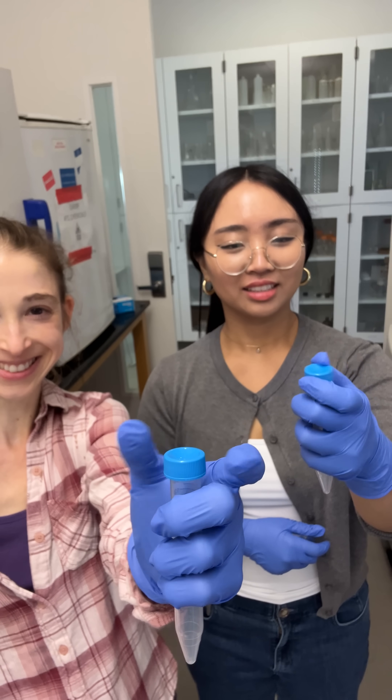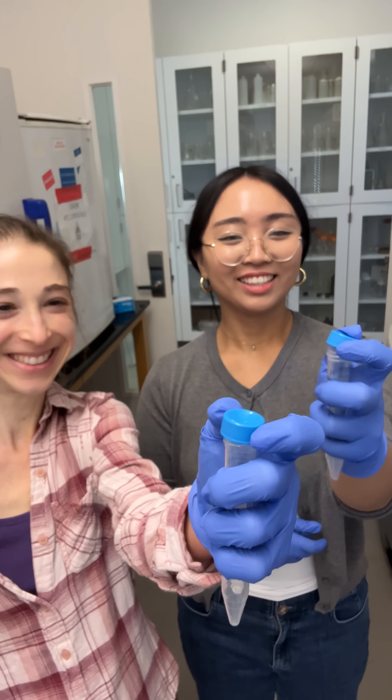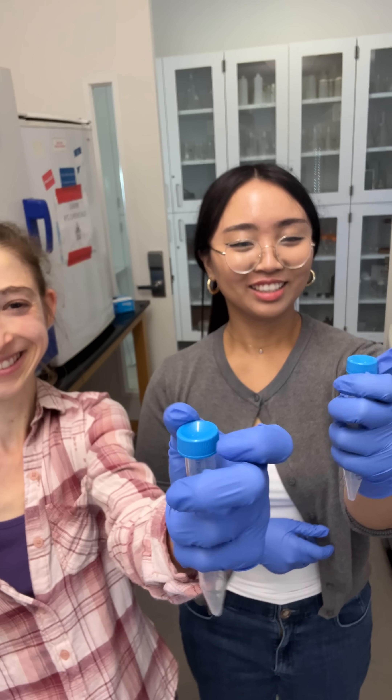It takes practice, but just get some practice if you want to be in a lab. I highly recommend getting some practice doing things with one hand.